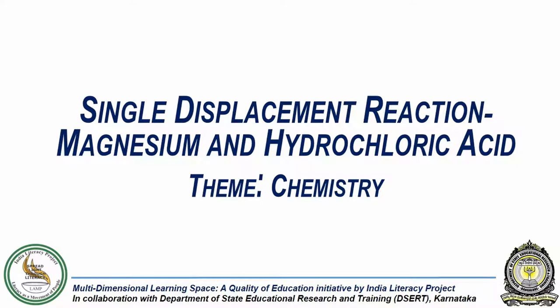In this experiment, we will study the reaction between magnesium and hydrochloric acid.